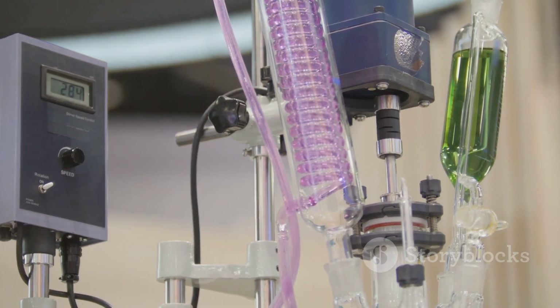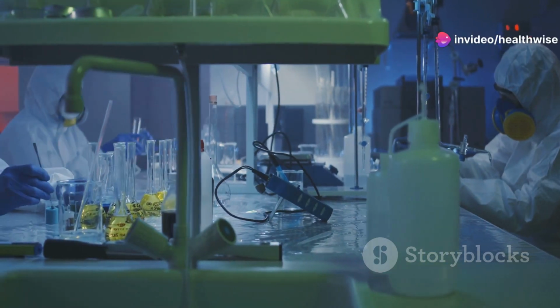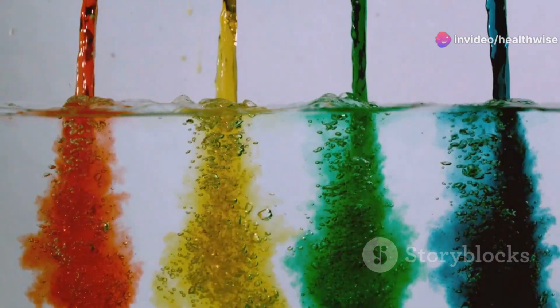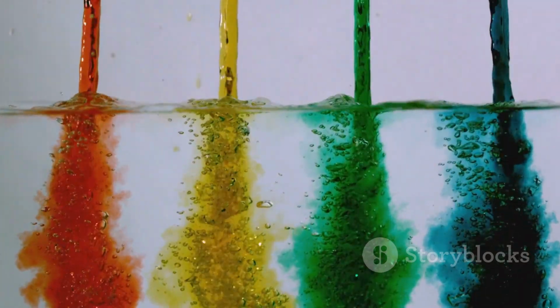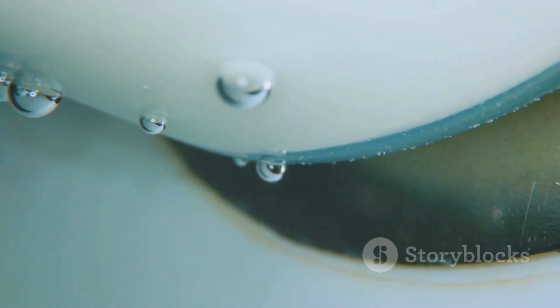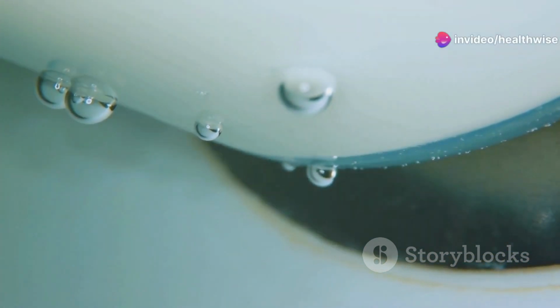Chapter 4. Partition chromatography, a balancing act. Let's explore the world of partition chromatography. It's like a delicate dance between two phases, the mobile phase and the stationary phase. In this technique, the stationary phase is a thin liquid film coated on a solid support, while the mobile phase is a liquid that flows over the stationary phase.